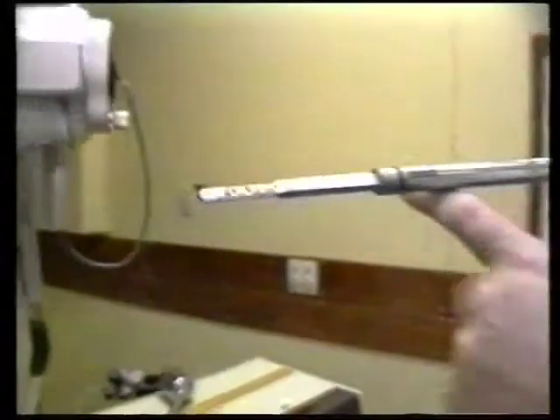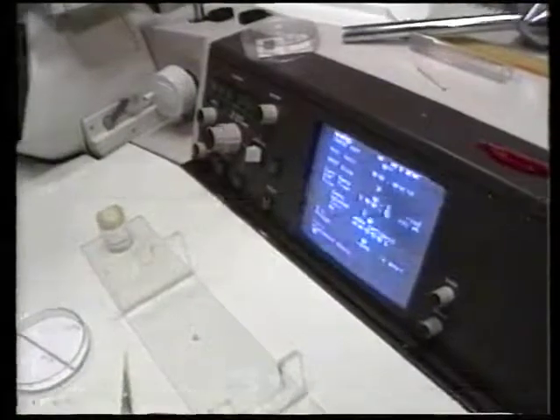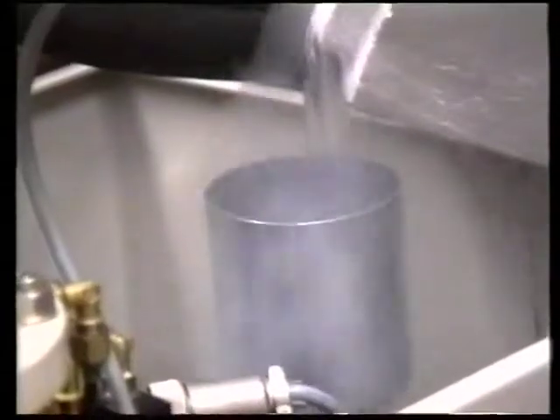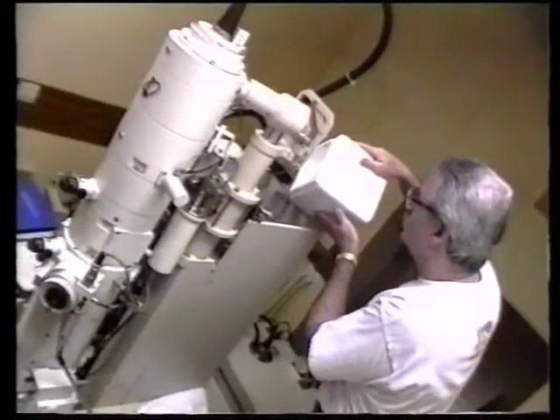What we've been trying to do is to take those shellfish and see if there are actually virus particles in them. And the only way we can really do that at this stage of the investigation is to use the electron microscope. We don't have any other detection tools, and we can't use a light microscope because it doesn't magnify as much. A light microscope will give you maybe 300, 500, 1,000-fold magnification, where in this one we're working at 30,000 to 50,000 magnification normally. It will actually go up to 250,000.